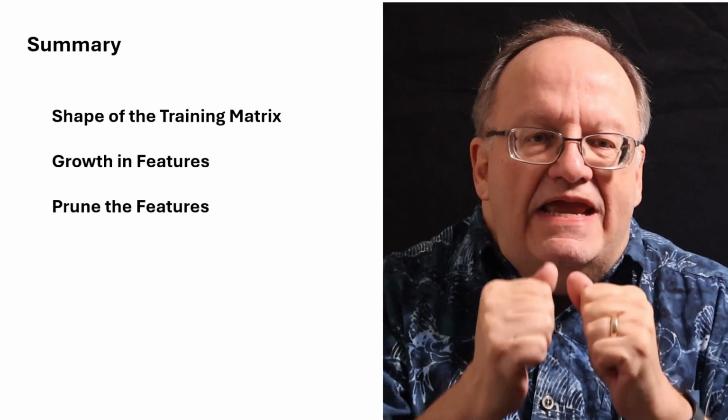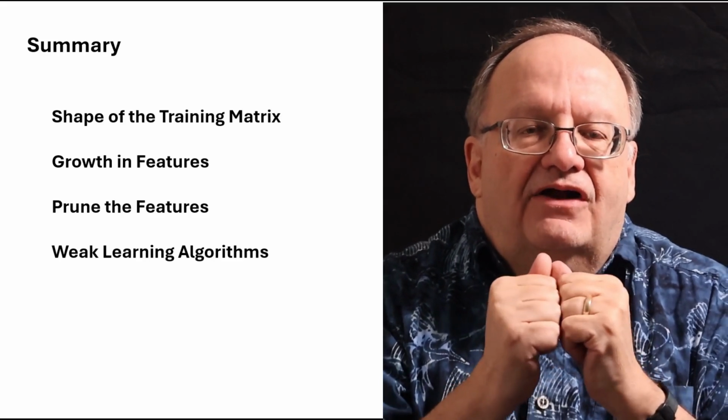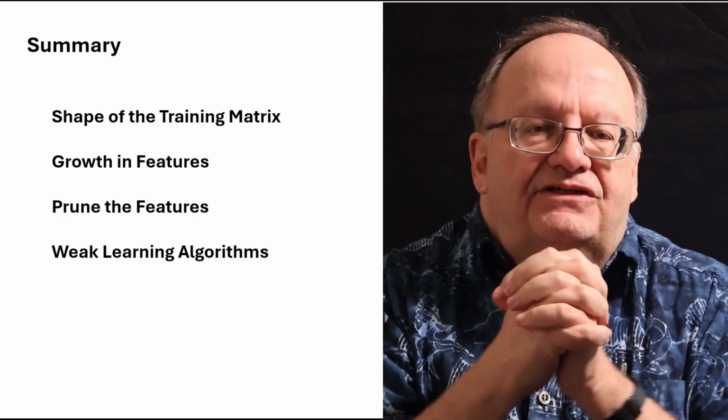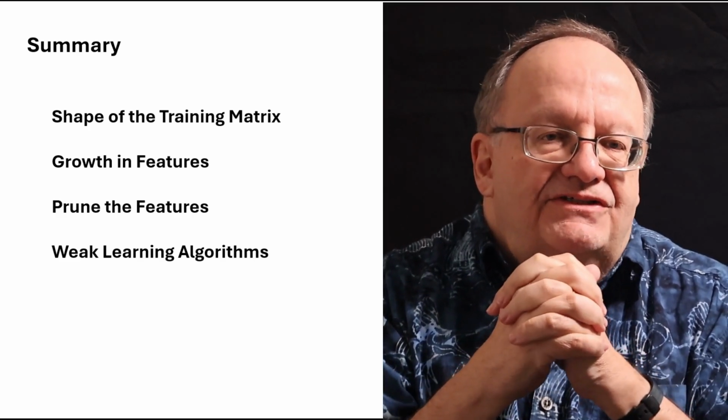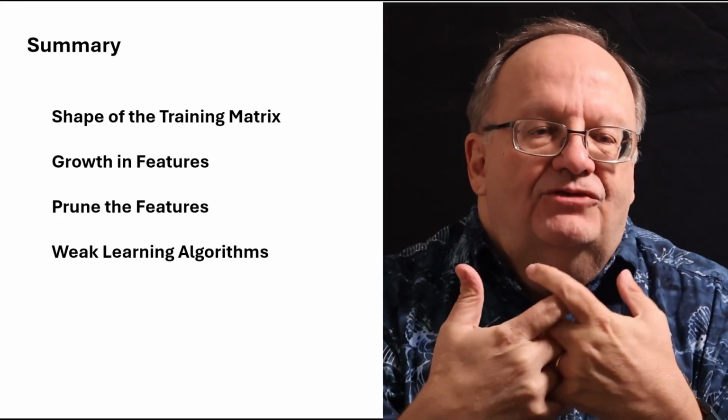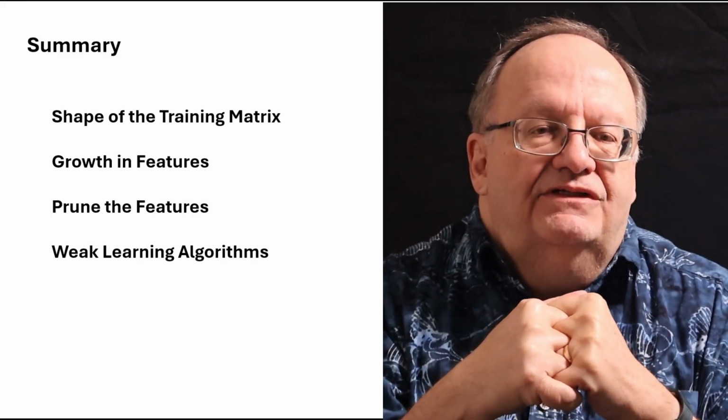Last thing, we use weak learning algorithms. These are algorithms that do not learn really strong, complicated decisions. They are relatively simple decisions because we don't want to overwhelm the knowledge we actually have in our relatively few examples.